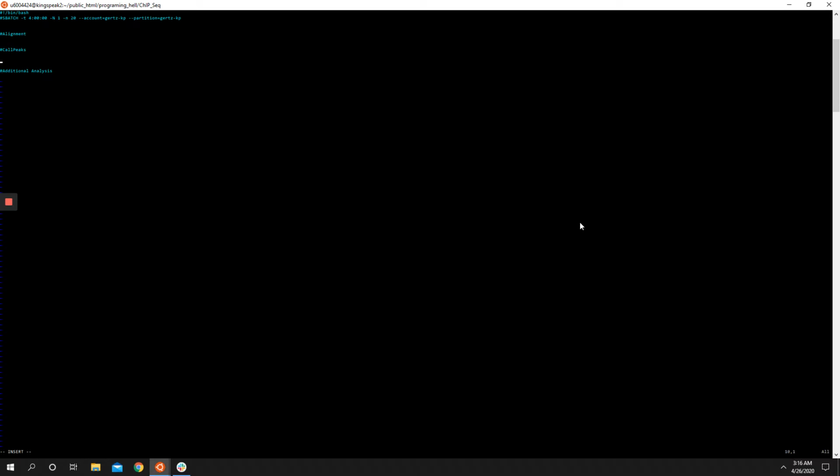Or we can write notes for ourselves, or other poor schmucks who have to go through our code later. So you'll note, if you ever look at my code, you're not going to see a whole lot of these, but that's a bad habit. It's nice to comment up your code for people who have to look at them later.